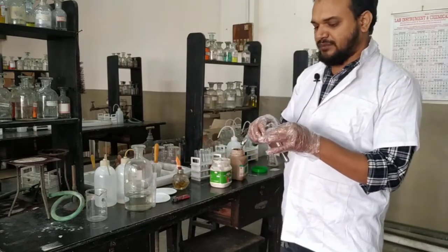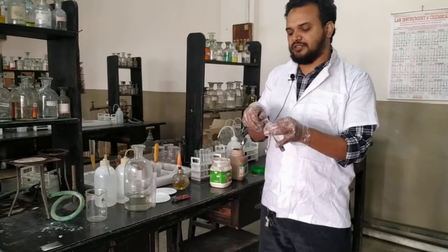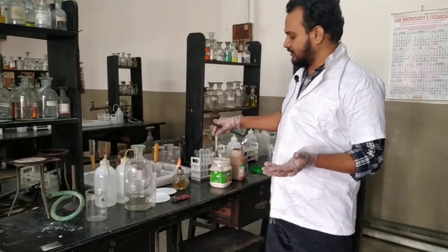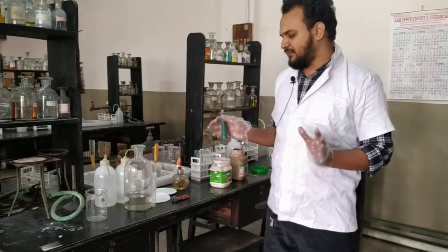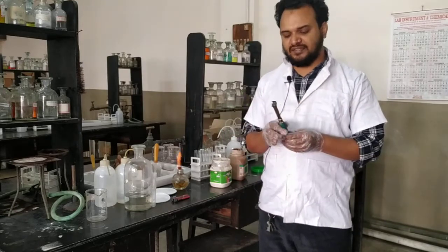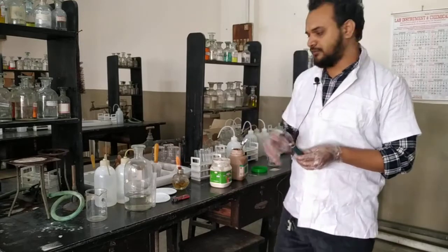So this is all about your Tollen's test. The Tollen's reagent will be supplied. You just make an aqueous solution of glucose, keep a good concentration, a handful amount of glucose, and just add Tollen's reagent and patiently heat it until the grey silver mirror comes at the walls of the test tube. Next we will move to the other test.